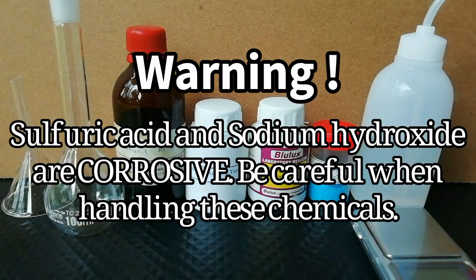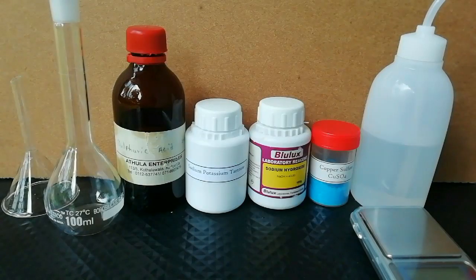Warning: sulfuric acid and sodium hydroxide are corrosive. Be careful when handling these chemicals. For this reaction, I use copper sulfate, sodium potassium tartrate, sodium hydroxide and concentrated sulfuric acid.